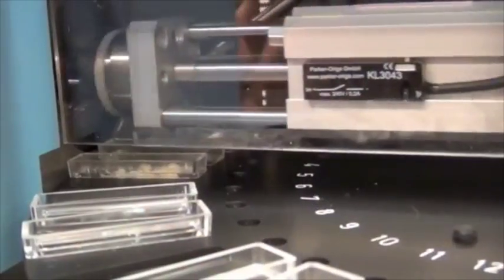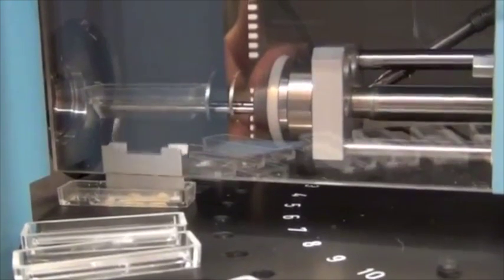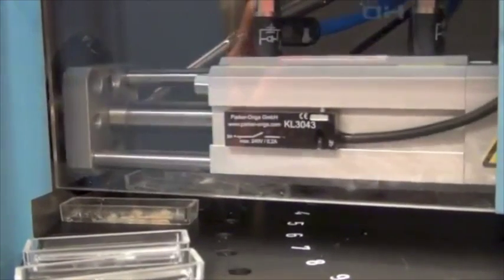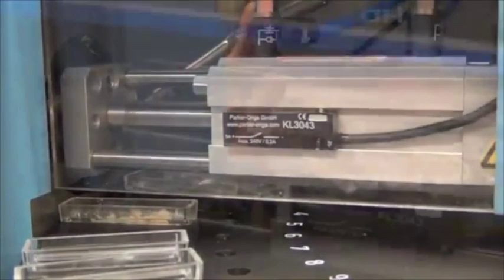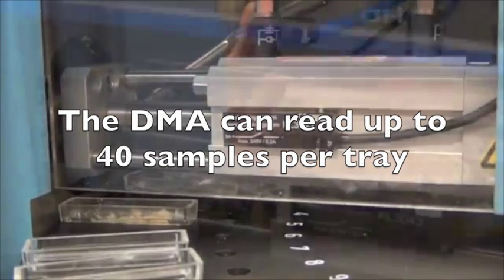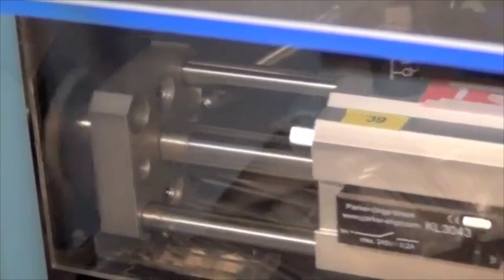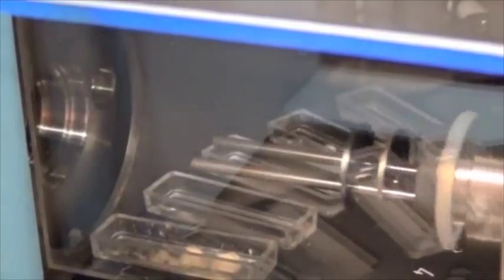When the analysis starts, the machine raises the sample and places it into the testing chambers. With a large batch of samples, we weigh out a sequence of samples and program the location of each one on the tray, and the machine can automatically pick up the samples one by one. Here the tray rotates to locate the next sample and starts another analysis.